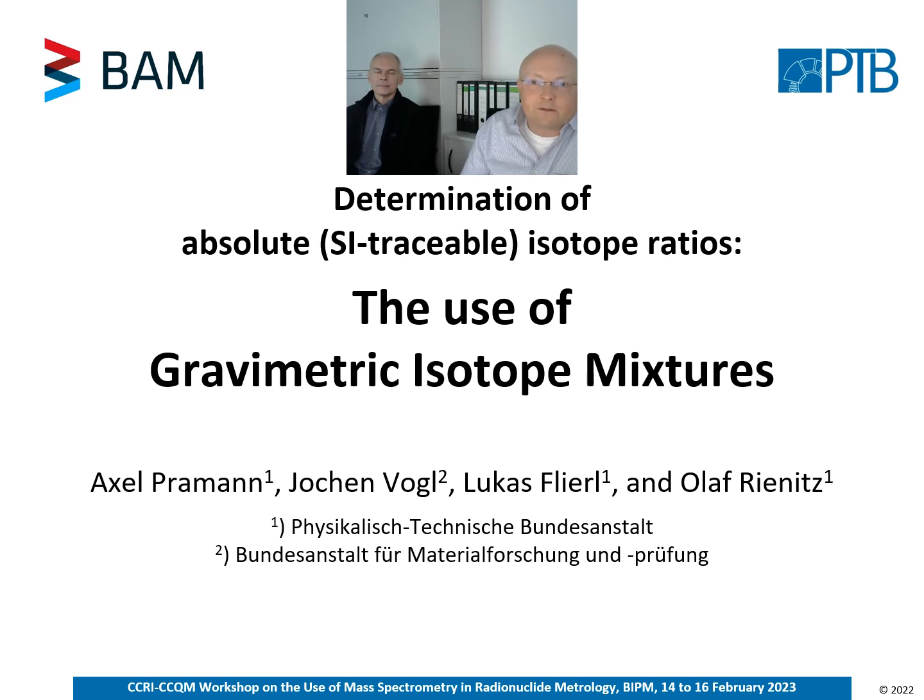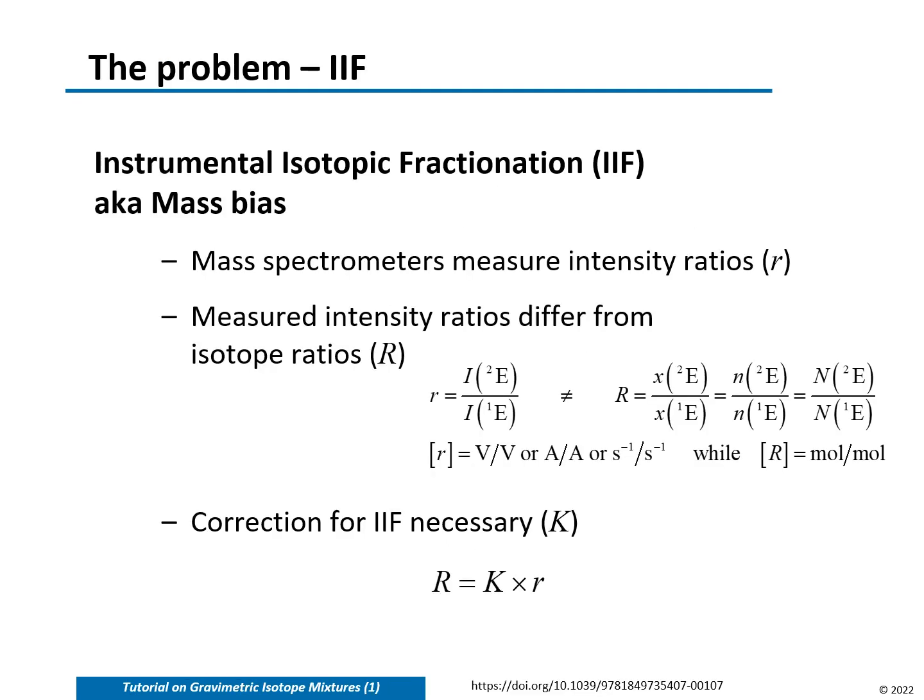Welcome to this short tutorial about the determination of absolute isotope ratios. We're going to give you a really brief overview on how to use gravimetric isotope mixtures to determine SI traceable isotope ratios. Therefore, let's directly start with the actual problem.